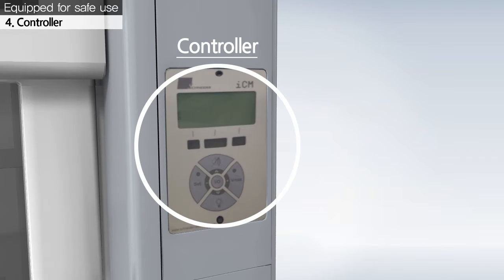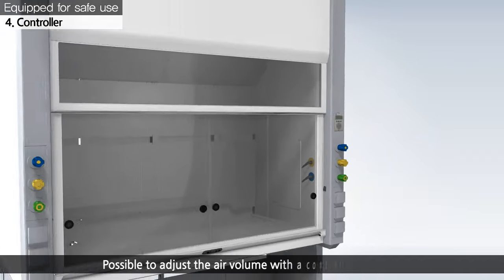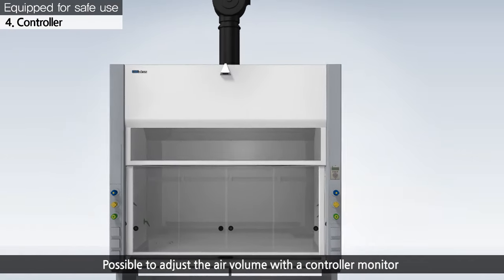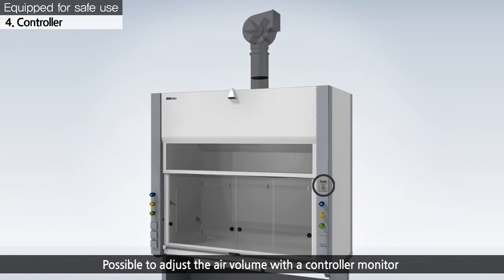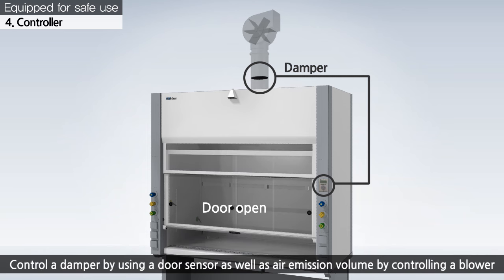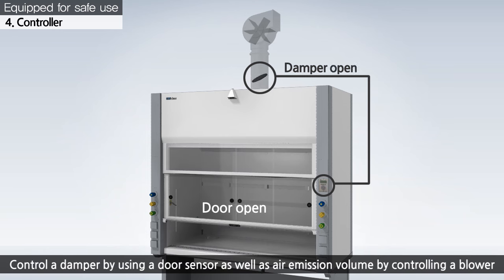The CHC Lab fume hood can control the air volume through a controller with a VAV system. It can control a damper by using a door sensor, an air volume sensor, and air discharge volume by controlling a blower.